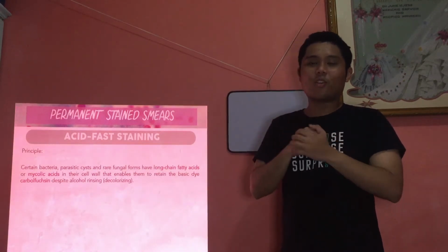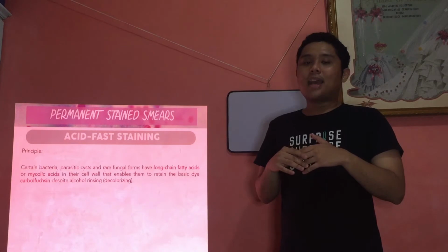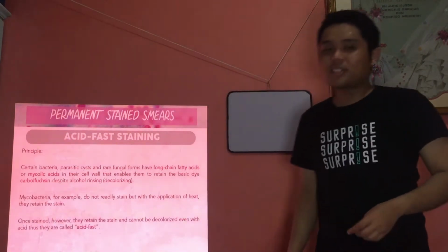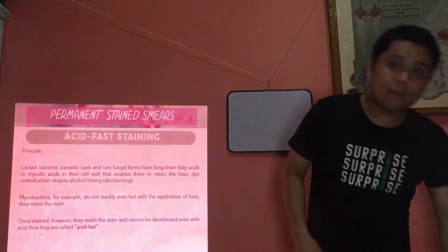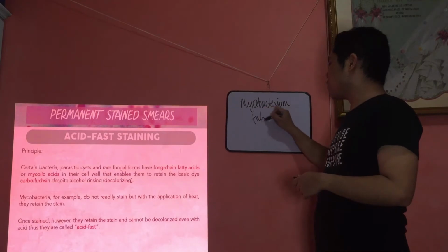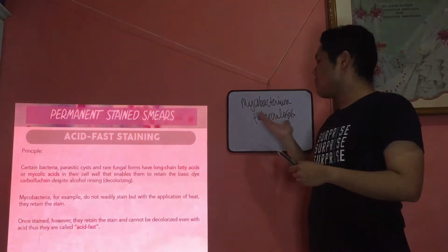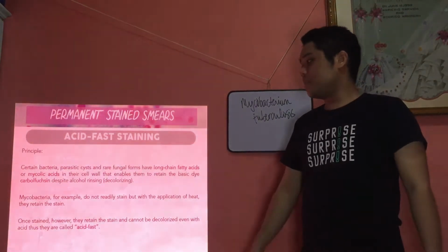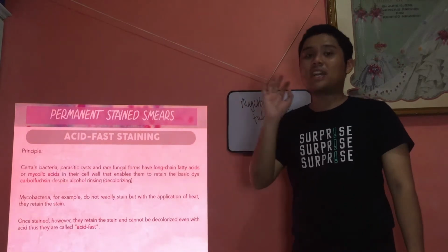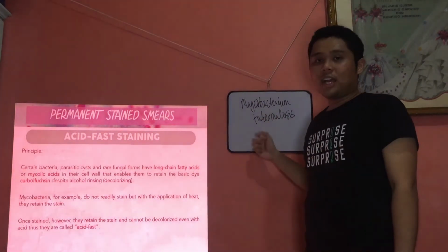It holds on tightly. Acid fast: it is able to resist decolorization by the acid alcohol. Later you'll understand more. We use this primarily for mycobacteria, your Mycobacterium tuberculosis, the causative agent of tuberculosis. It's in the name: Mycobacterium tuberculosis. They have these long-chain fatty acids. The true acid-fast staining procedure is primarily used for the diagnosis, identification and detection of mycobacteria, specifically for tuberculosis.